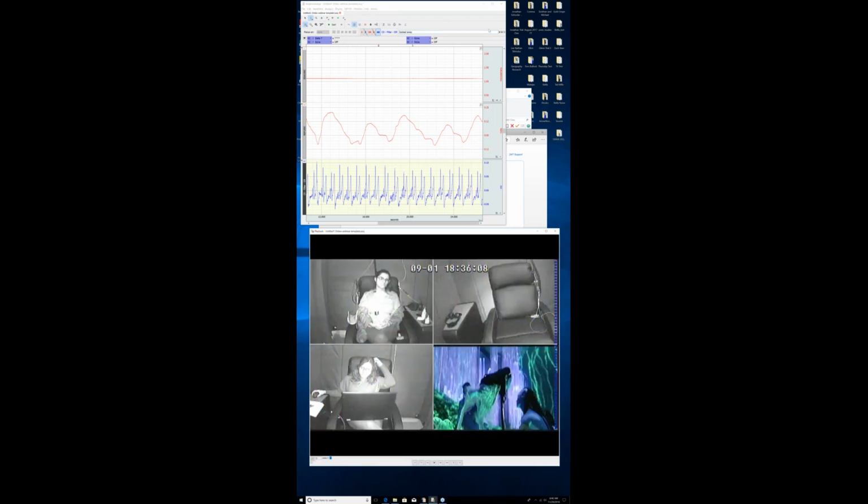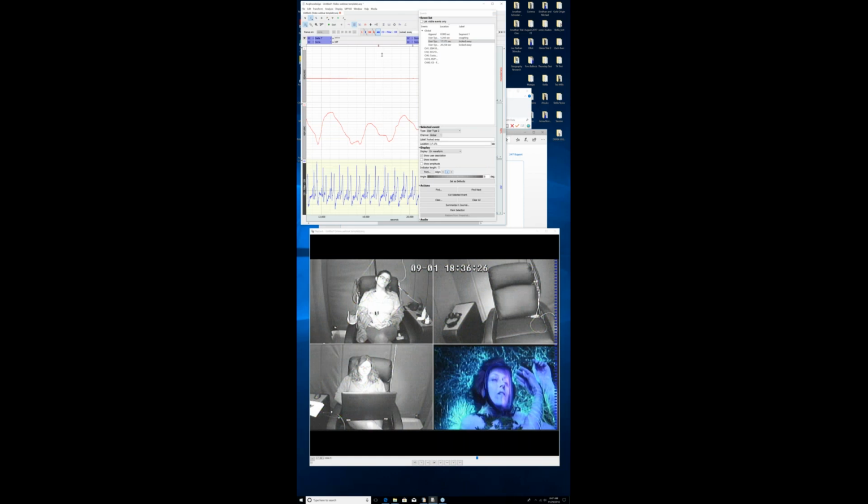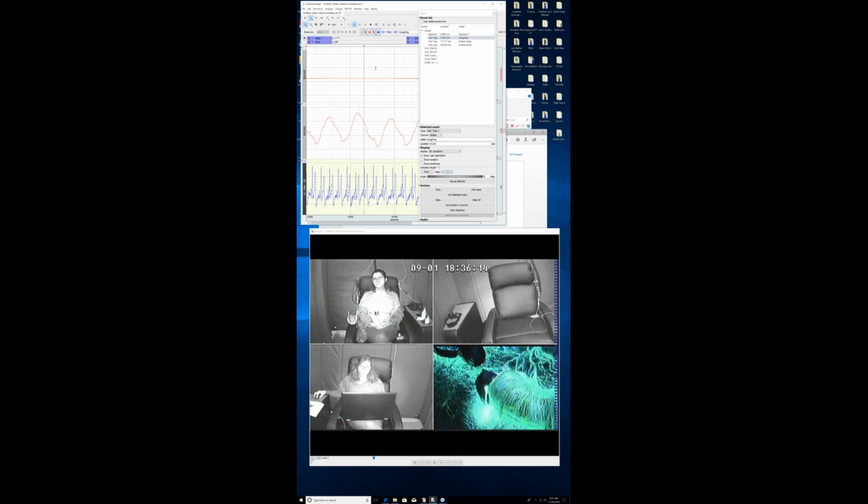So we're back to the playback viewer. If I open this back up and move this over, this is taking me precisely to the point in the video, and all I do is I just have to jump down, and it's advanced me to that point. We can go to coughing. So now we're at the coughing point, and right there we've advanced the video to that point. So this is one way of doing it.